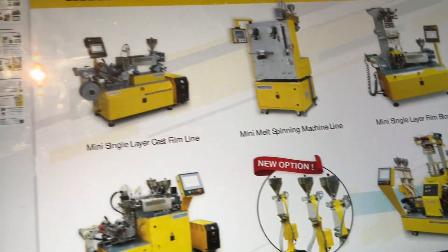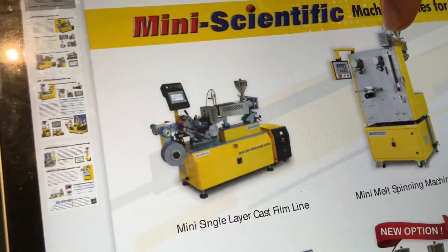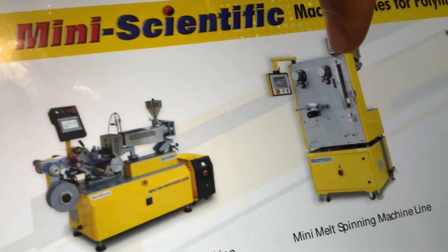The last one — the new machine we developed here is the melt spinning machine.